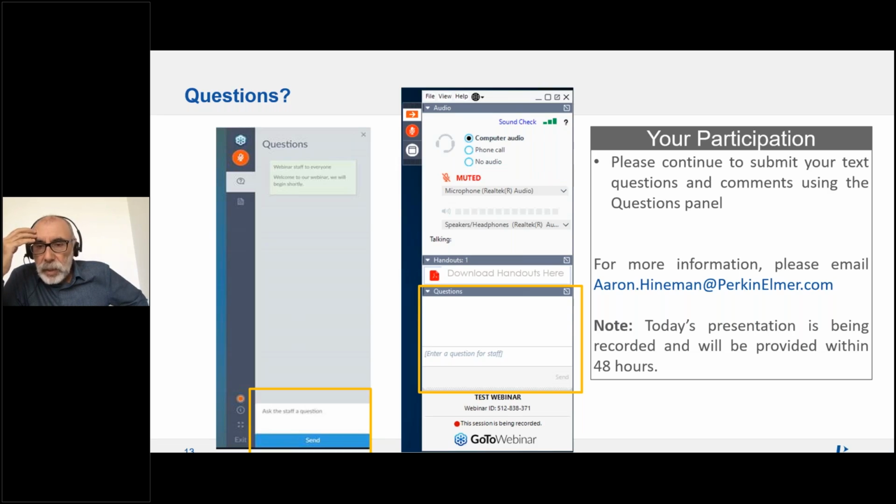In practice, we have checked this with bacteria suspension, and just in case there are big lumps of bacteria, you can get some spikes. But in a similar way, this can be removed by digesting the sample with some nitric acid and some heating. You can digest these bioparticles.